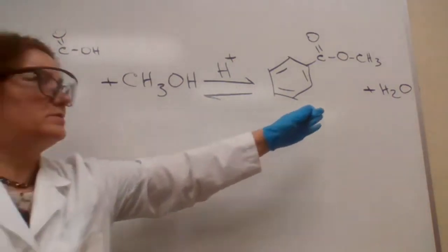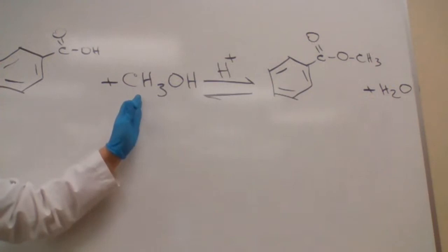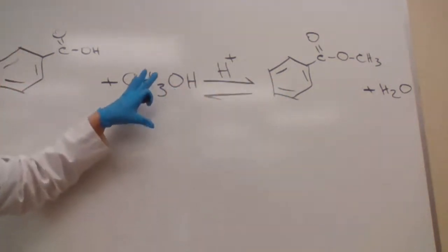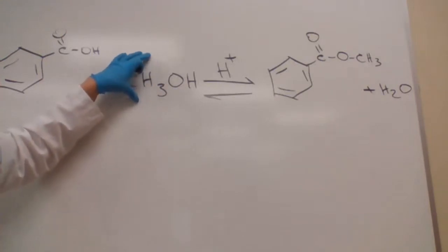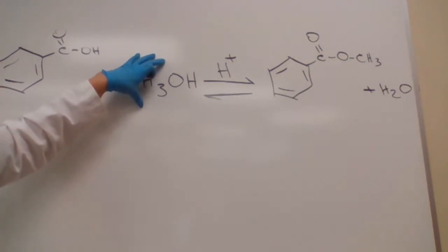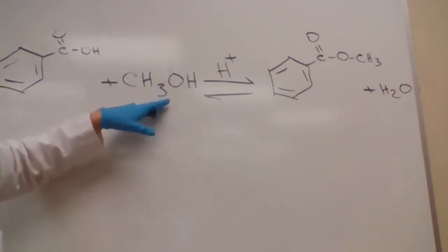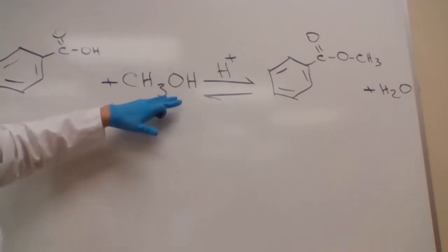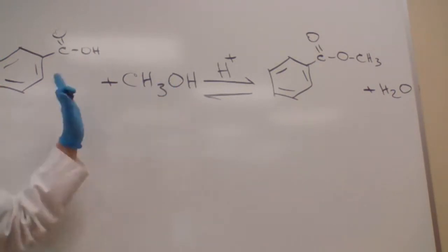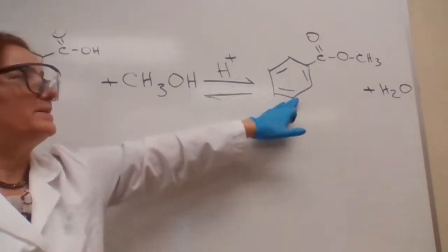So if you increase the concentration of the water, the reaction would go to the left. If you increase the concentration of methanol, the reaction would go forward. So basically, we used an excess amount of methanol. We used 25 milliliters, that was an excess amount of methanol. If you calculate the mole ratio, you can actually find the number of moles for methanol and benzoic acid. So we are using a high volume or excess amount of methanol to make sure the reaction goes forward and forms methyl benzoate.